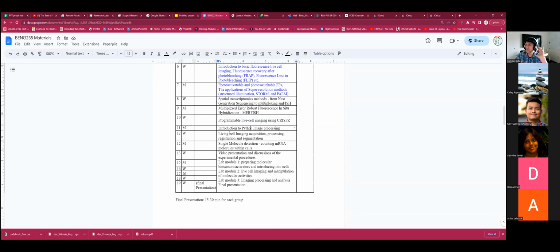There'll be, similarly to last year, a practical component to the course, which will be an experiment. It'll be a different experiment than last year. I thought it would be fun to have an experiment in the spirit of the course: have a very simplistic sample of a few cells crawling on a dish, dividing, image them over a few time points, likely primarily their nucleus, fix the cells and do a simplified form of MERFISH, just measuring a few single molecules, single transcripts in them, and then merge that later information with the original information of the position and likely the lineage of the cells.